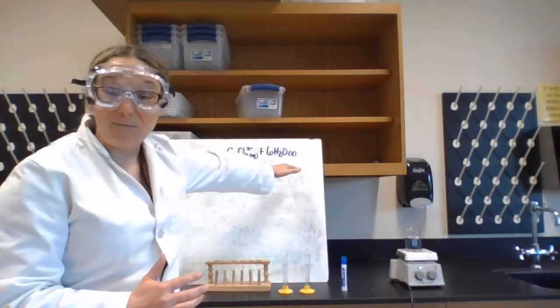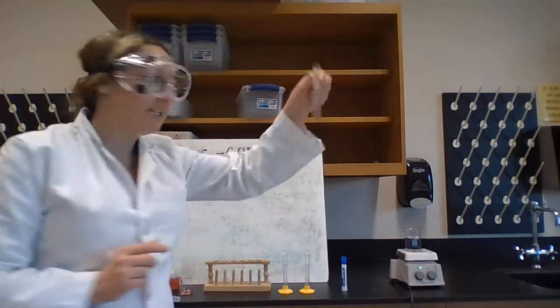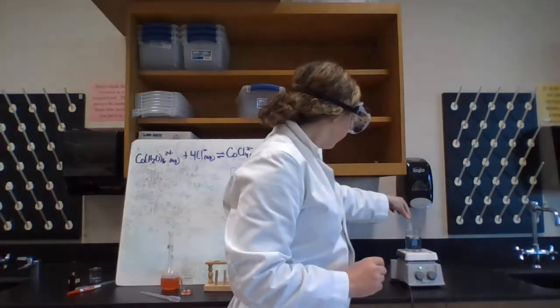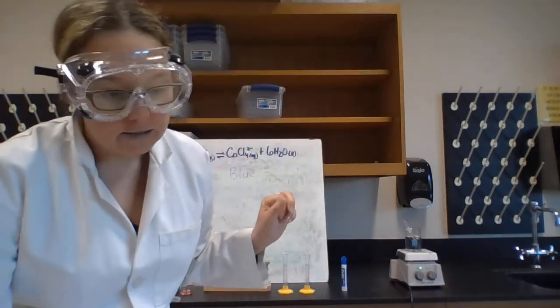So I added water and I shifted. Okay, so let's look at the next one. It now tells us to take this tube and place it into a water bath. So we're going to just kind of let that one sit for a second and let it do its thing. And let's move on to the final one. All right.